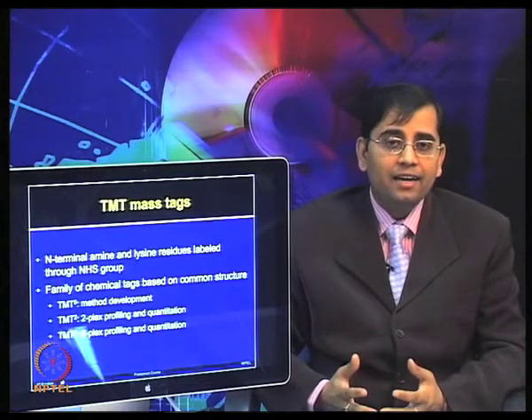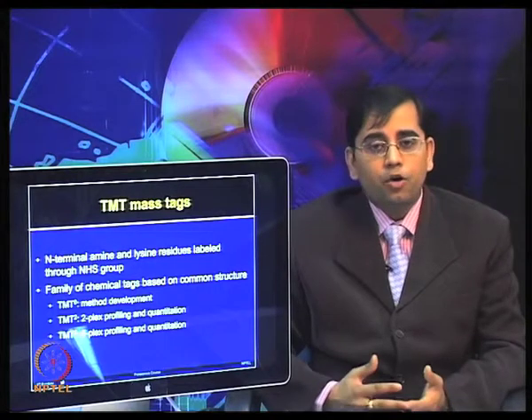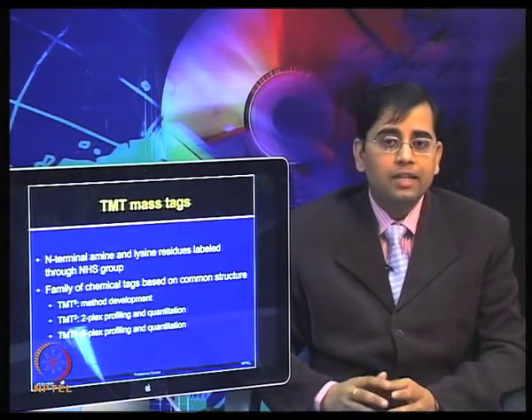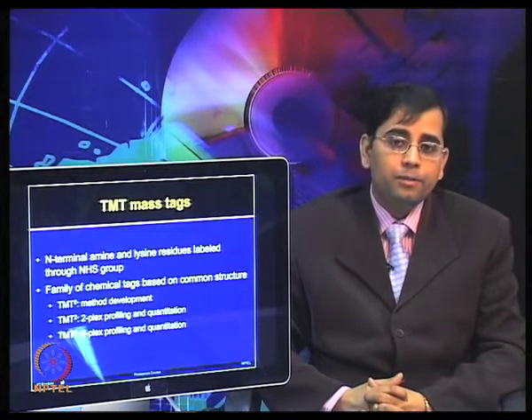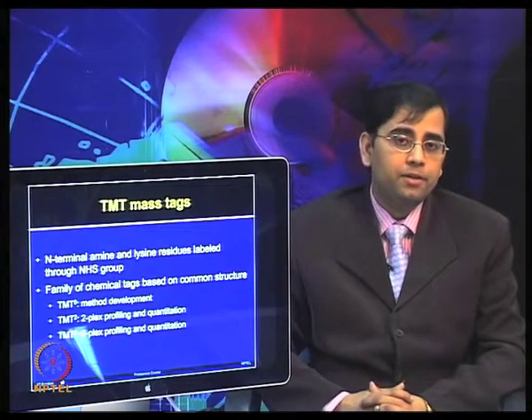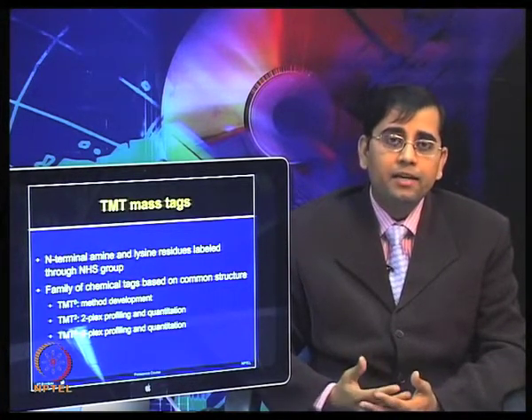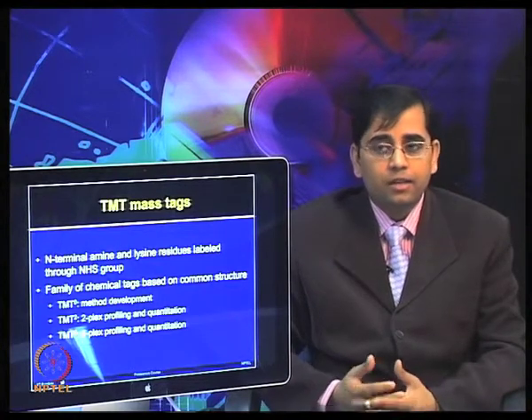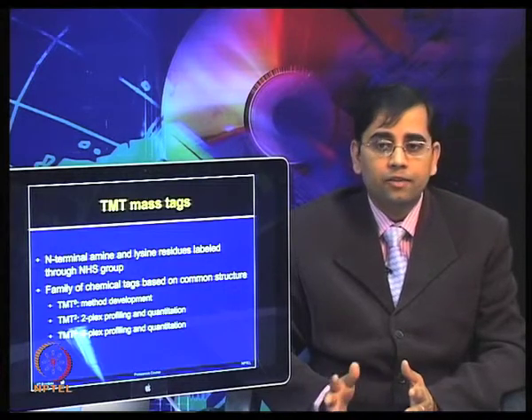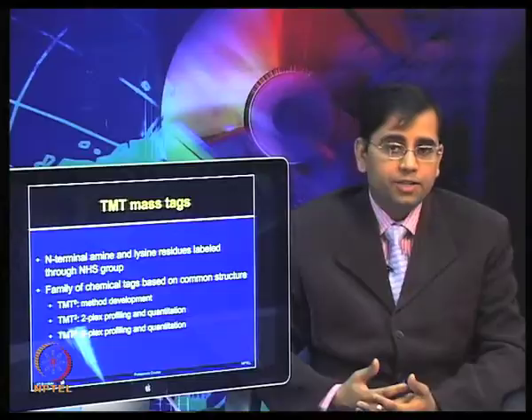While duplex and 6-plex labels, TMT differ by the number of isotopic substitutions. The TMT 0 is a non-isotopically substituted structure that has been produced only for method development. During the MS-MS analysis, the TMT tags give rise to 6 reporter ions from 126 to 131 Dalton. Therefore, it allows for the relative quantitation.